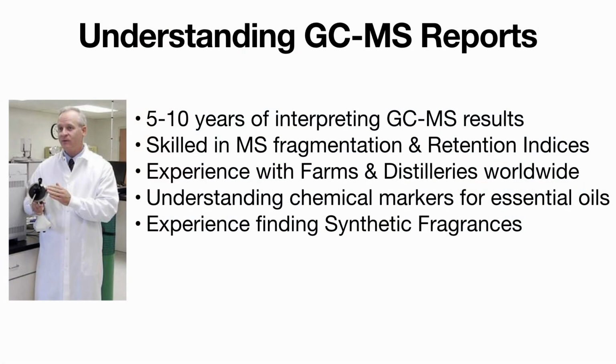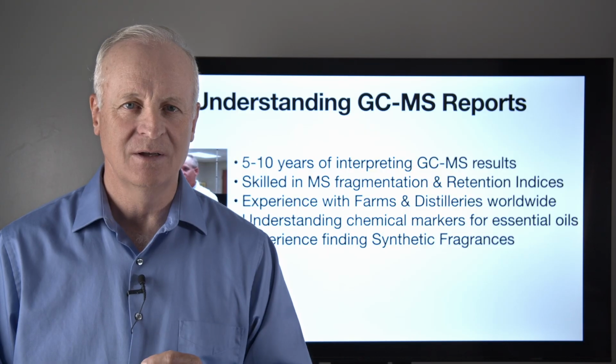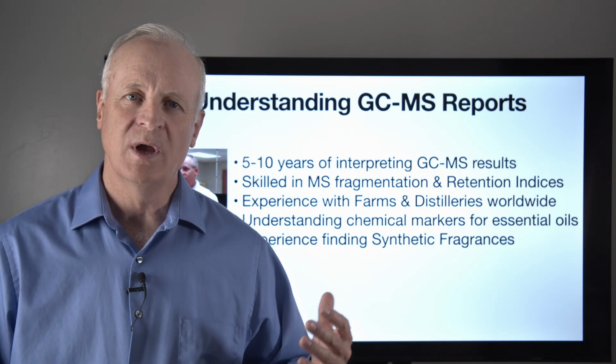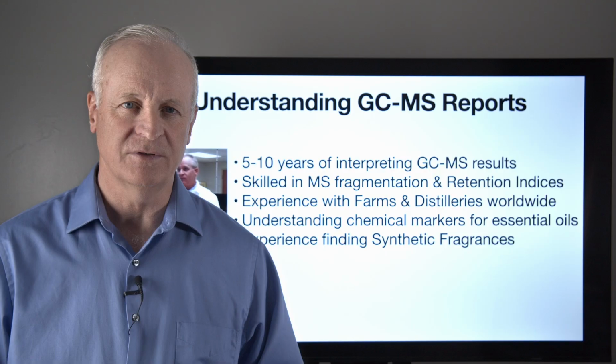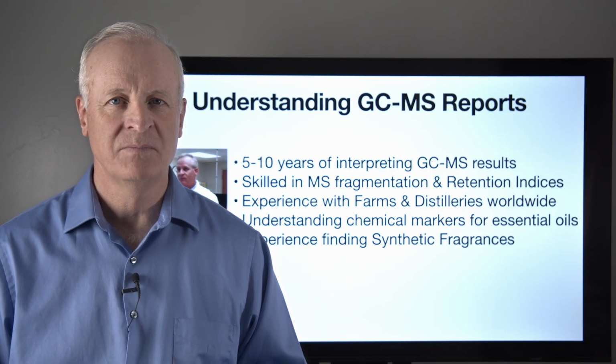Let's look at some more requirements. 5 to 10 years of interpreting GCMS reports would be required. You should also be skilled in MS fragmentation and retention indices. You should also have experience on farms and distilleries throughout the world where essential oils are distilled and collected, and also where aromatic products are harvested. Knowing this information helps you as the analytical chemist.